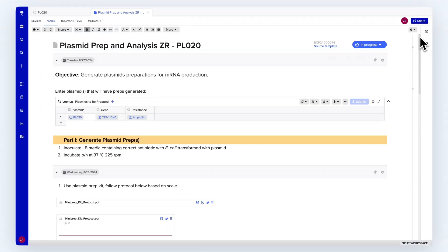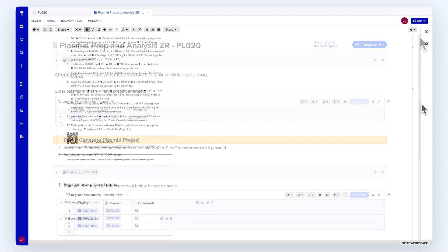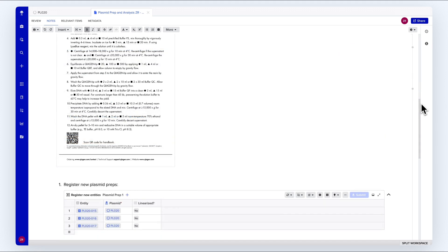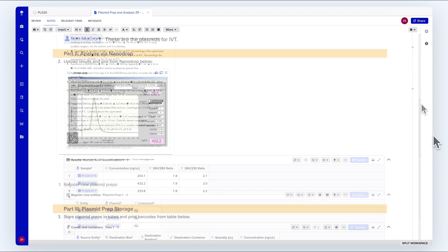Here, we are inside a notebook entry about plasmid prep generation and QC. I can make these entries as flexible or as structured as needed. For example, I can organize parts of my experiment as shown here.